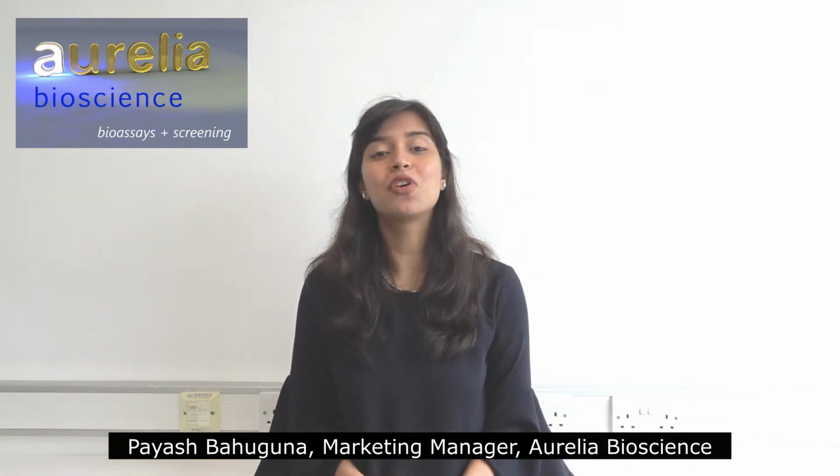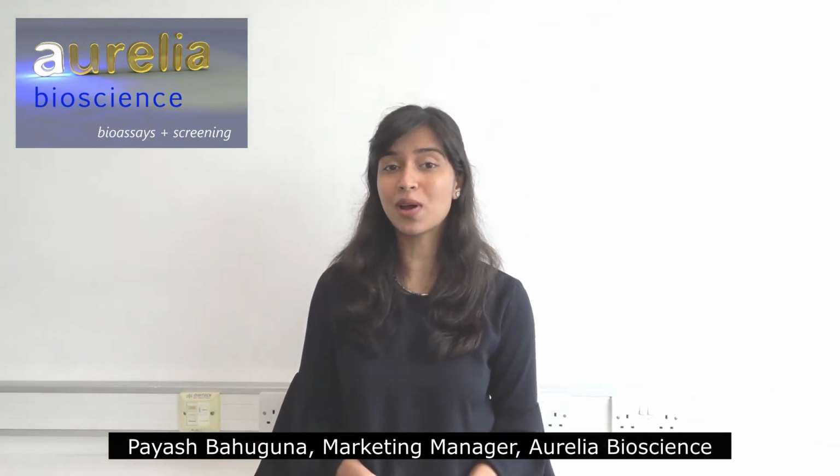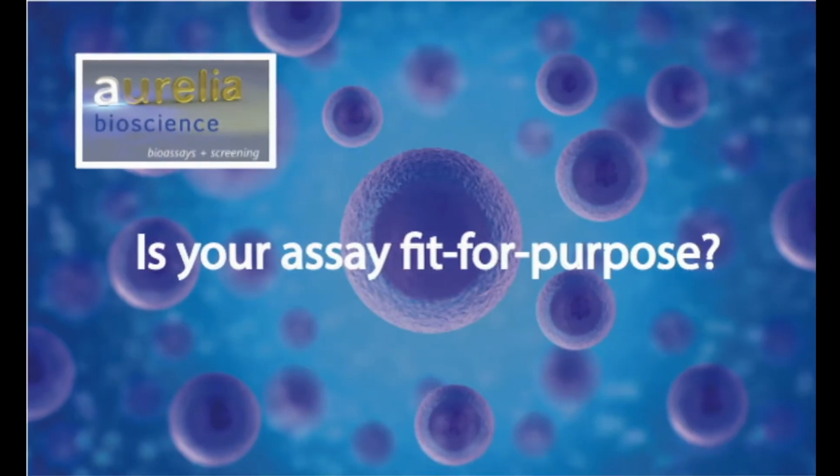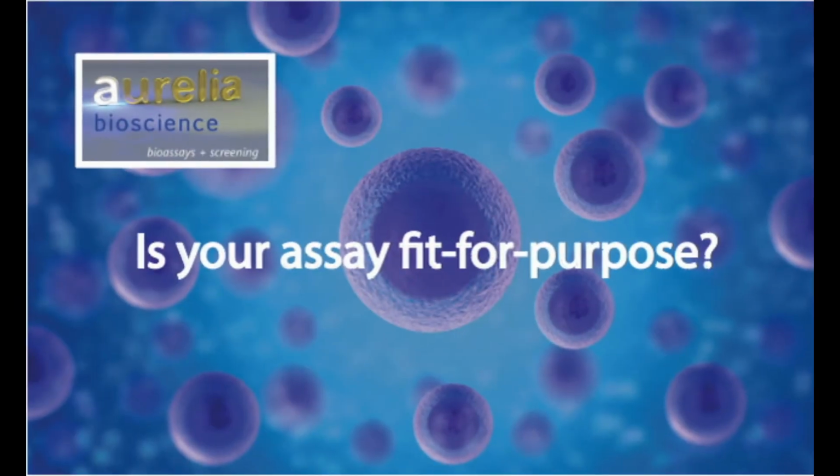Hello and welcome to our fourth vlog on how to build effective in vitro assays for early drug discovery. In our previous vlogs, we have discussed the key principles and practicalities of bioassay design. Here we look at how you can carry out bioassay validation to confirm that your bioassay is fit for purpose.